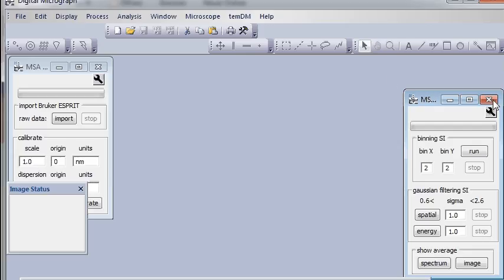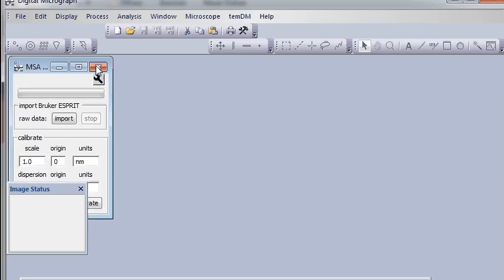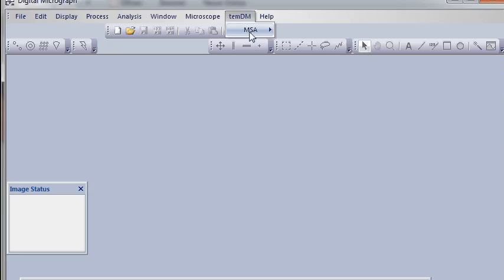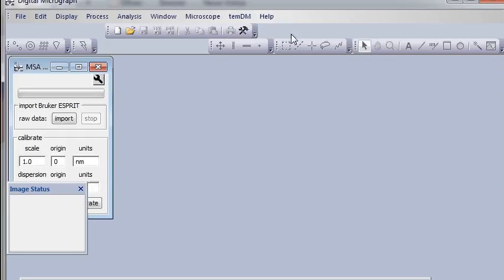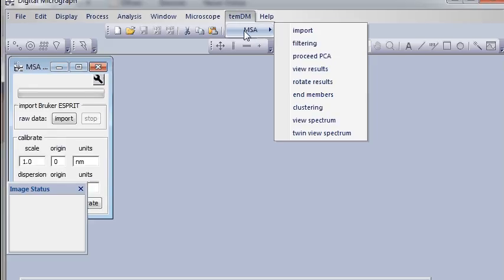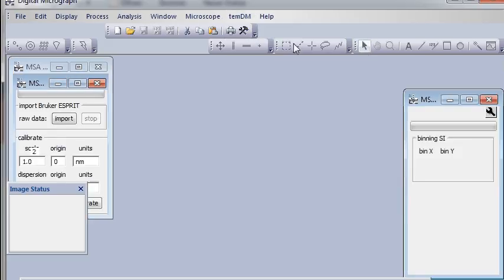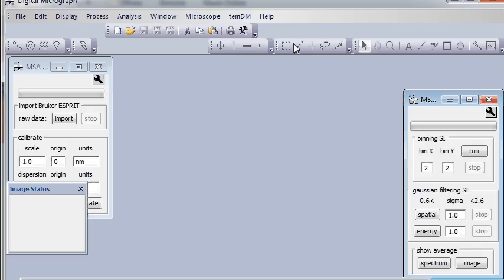And when you close it and open it again, they appear exactly at the position you used them last time. Well, there are more settings to be stored. You will learn it while exploring the package step by step.